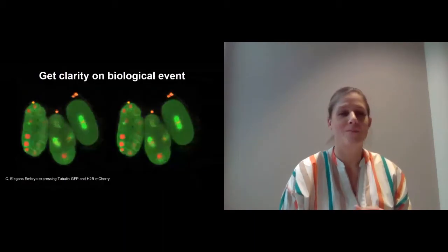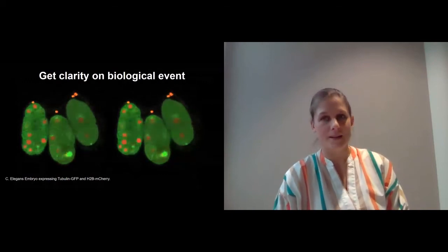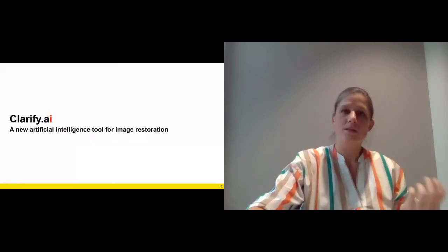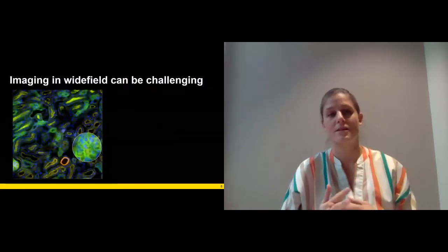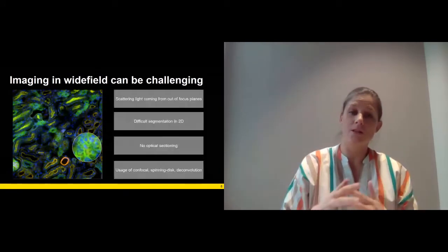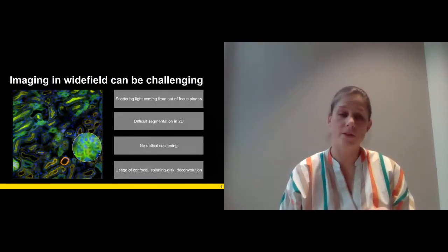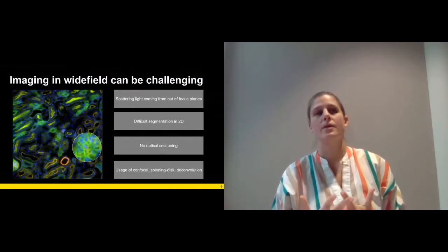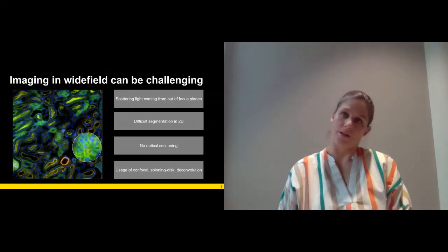So these embryos you can see very nicely and much better with Denoise.ai what's actually happening. The noise in confocal imaging is often the problem. In wide field imaging it is the haze, let's say. And we know these challenges, all of us know them: scattering light, difficult segmentation. We're not having the optical sectioning we're having with the confocal or spinning disc, but still wide field imaging, especially in live cell imaging, I think has a lot of good advantages as well.